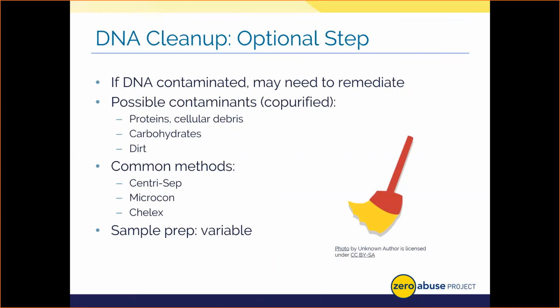They separate them. You know, Chelex, if you're looking at that, it's a sticky resin that binds to enzymes that might degrade DNA or destroy it. So what happens is you put this in a tube, and with high spinning you pull the contaminants down to the bottom and they get stuck in that resin. And then the DNA will be left in a liquid layer above those contaminating elements, and you can pull it out and extract it, and it's purified.